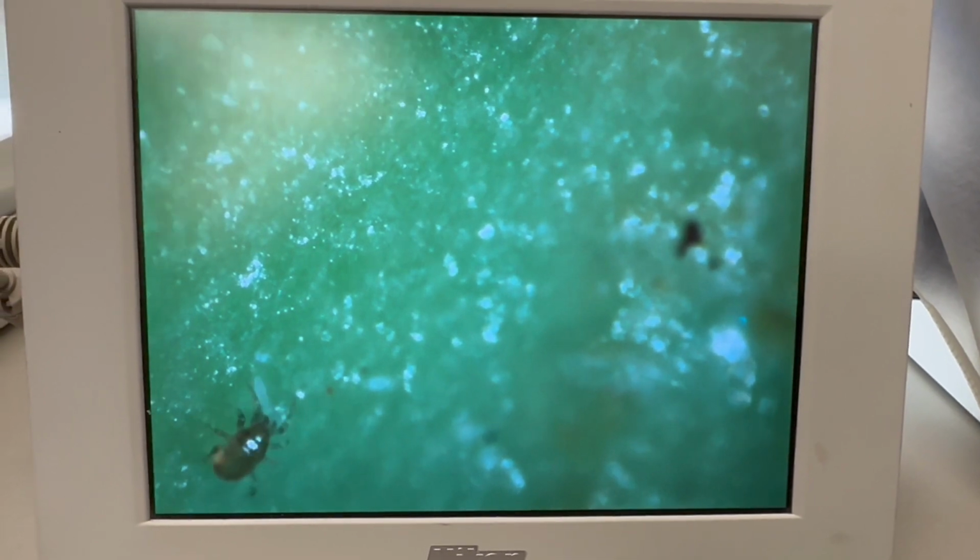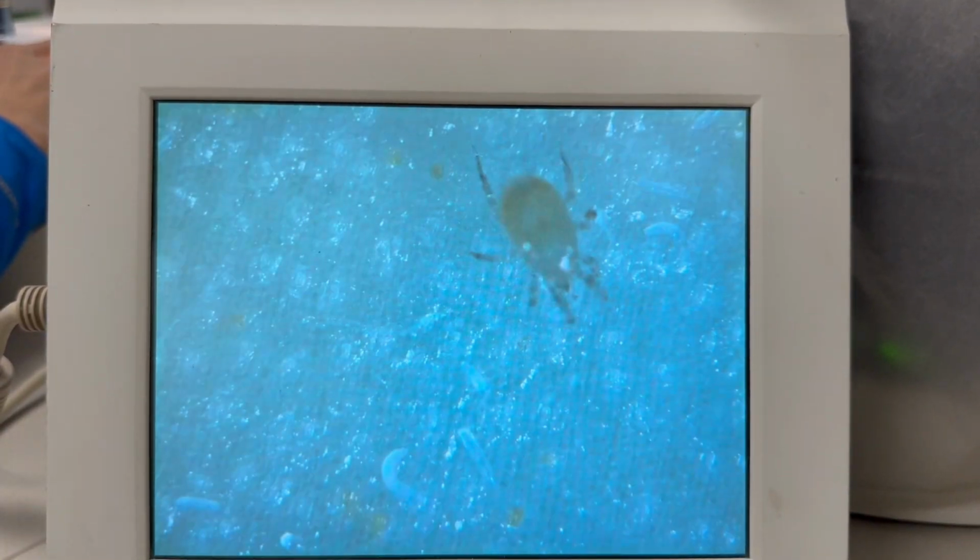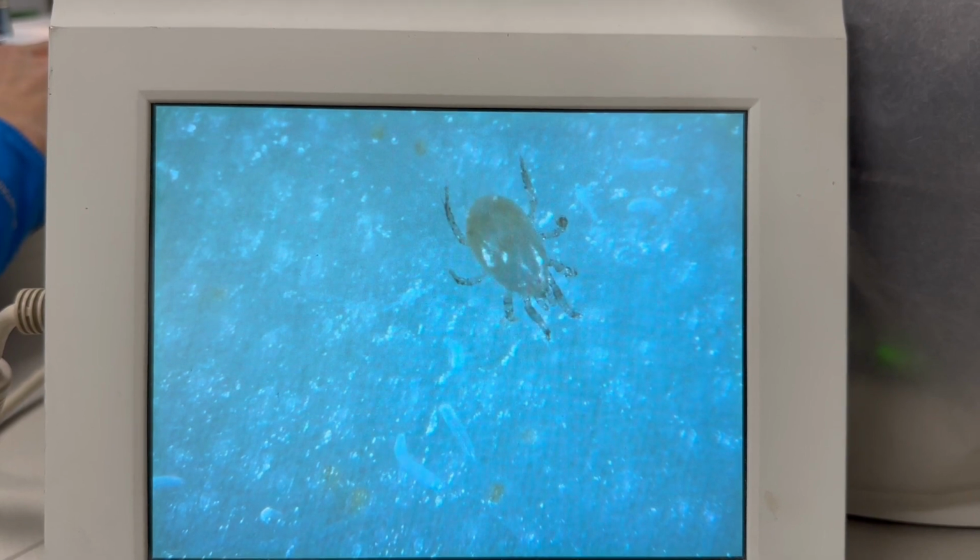Zoom in. Tell us what we're seeing, Eric. So we have a swirskii mite, Amblyseius swirskii, and he's got in his mouth, carrying around with him, an agave mite. It's difficult to focus on him because he's moving around so much, but you can see the front of his body. He's piercing into the outside of it. Earlier I'd seen some of them pierce into it, suck them dry, and leave a deflated husk behind. But yes, there's the predatory mite carrying an agave mite around in his mouth. He's biting into it.